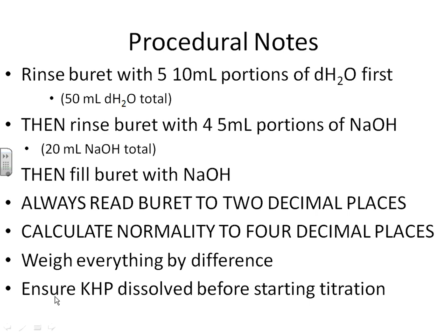So we need to rinse the burette out with NaOH before we fill it, so that by the time we add the sodium hydroxide that we're going to standardize, we know that it's not going to be diluted by anything else in the burette. So you're rinsing your burette with water, then you're going to rinse your burette with sodium hydroxide, and then you will fill your burette with the sodium hydroxide that you're going to standardize.